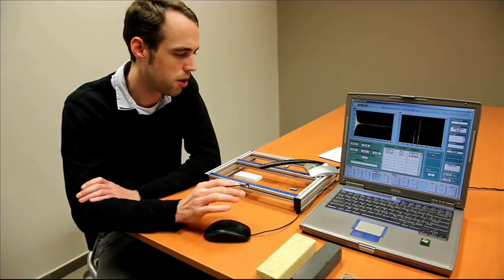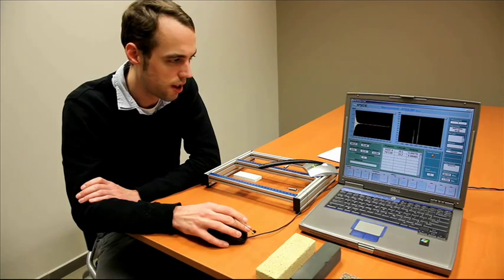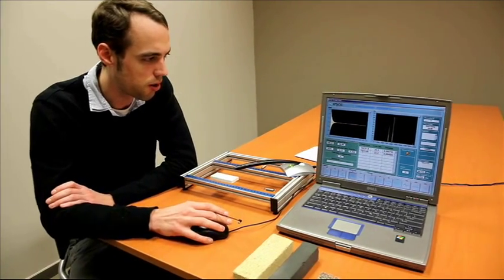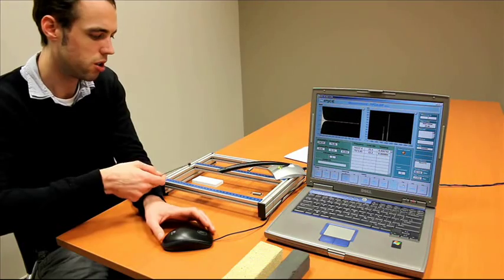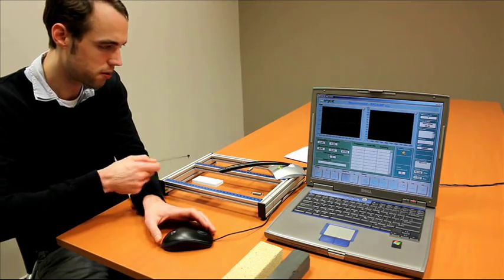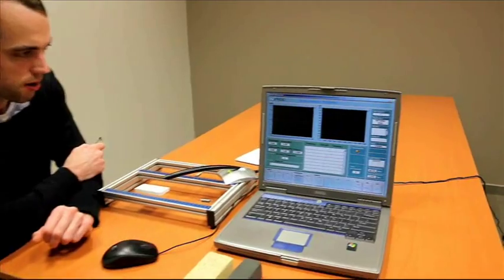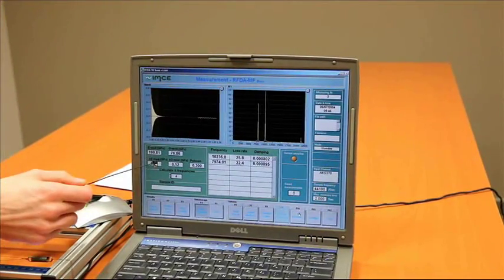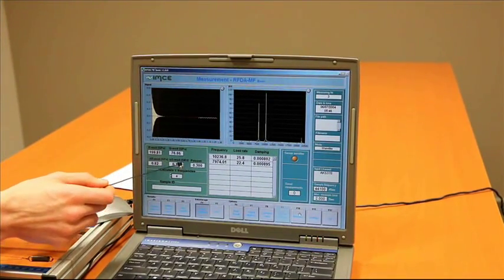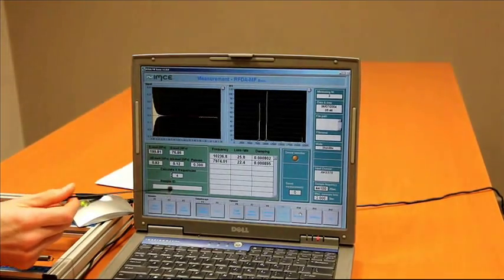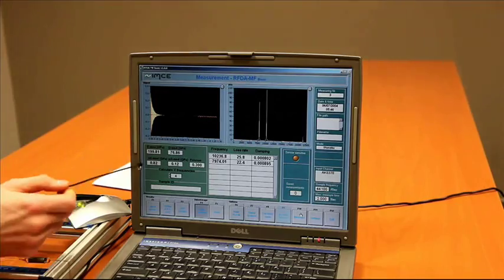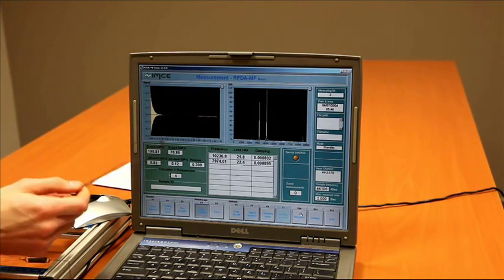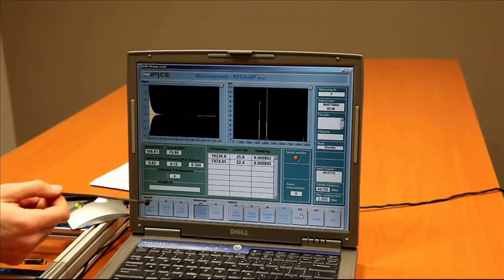Now, let's have a look at the reproducibility of the measurement results. We're going to do a couple of measurements and see how the Young's modulus, shear modulus and Poisson ratio change. We see again that we have about the same Young's modulus, shear modulus and Poisson ratio. Between measurements, you will have a maximum difference between the elastic properties of about 1%.